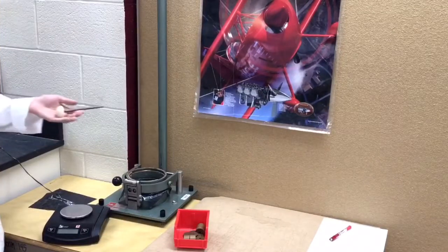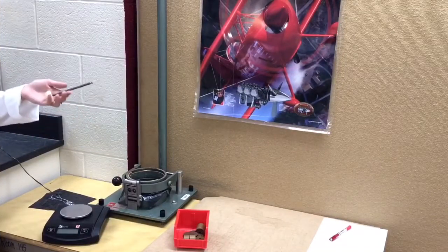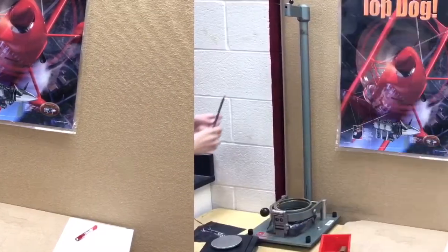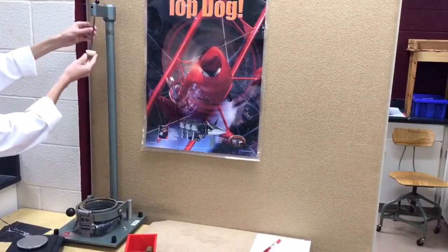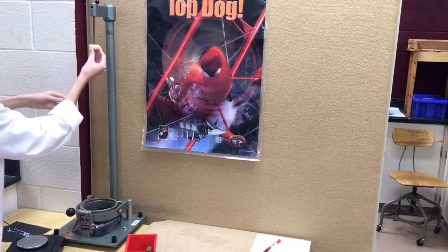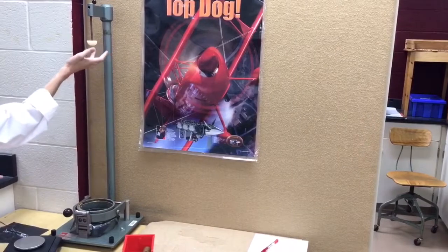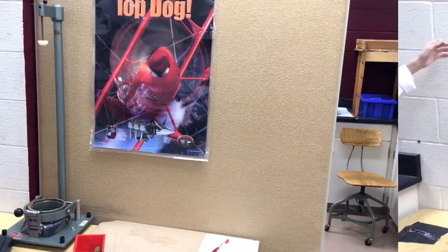Now let's look at the dart. Before you want to release the dart and test on any samples, you'll obviously want to mass the dart using one of the balances that we have in the lab. For loading the dart, you'll simply want to push the dart up into the slot at the top until you hear a loud firm click. Be careful not to let the dart fall out and waste any samples.